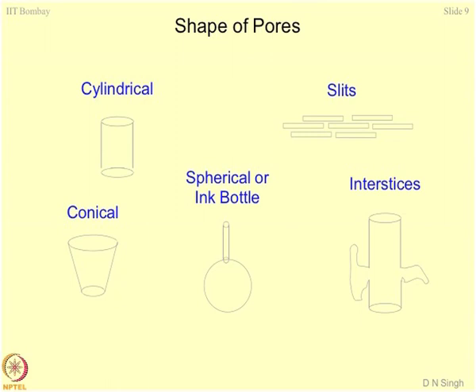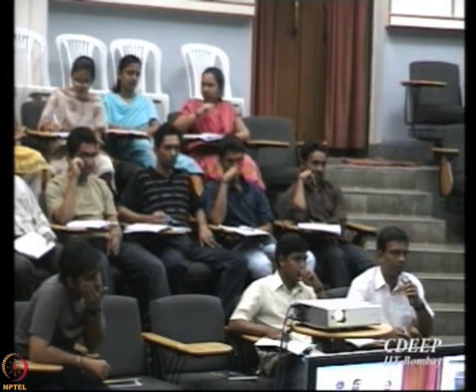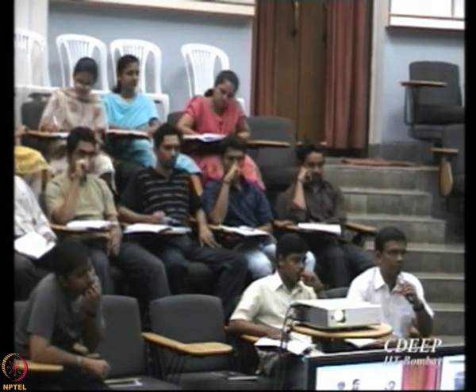So, these are the basic models which people have come up with when they talk about the porosity of the system. Now, how would you identify a pore is a million-dollar question. That again is a very intricate thing. How would you differentiate between these types of pores? The process of MIP and its results are required to be discussed. From that, basically, we can understand which are the types of pores. One of the examples, I'll show you how to differentiate between at least two types of pores.